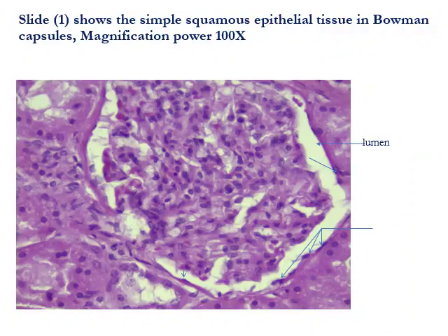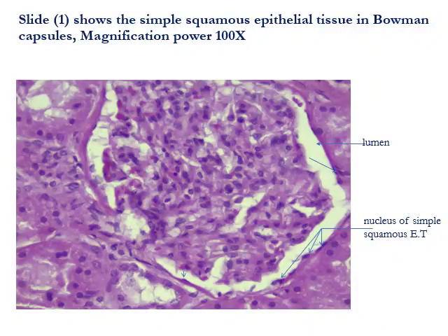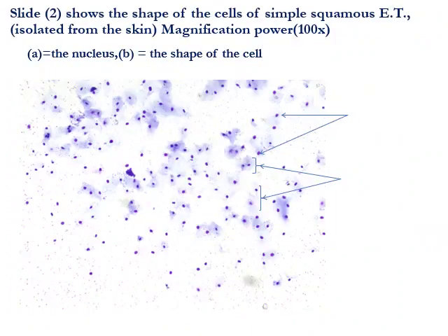This slide shows the simple squamous epithelial tissue in Bowman's capsule in the kidney. We can see the nucleus of the simple squamous epithelial tissue. This slide also shows the shape of the cells of simple squamous epithelial tissue isolated from the skin, where A refers to the nucleus while B refers to the shape of the cell.